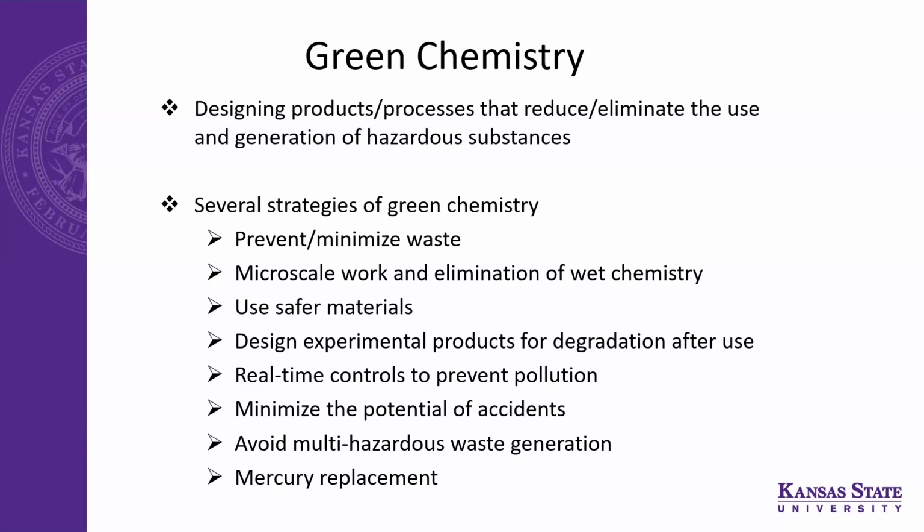So to address that, design products, processes, or reactions that reduce or eliminate the use and generation of hazardous substances, if there's the possibility. These are the things that you can implement in your lab to promote green chemistry.